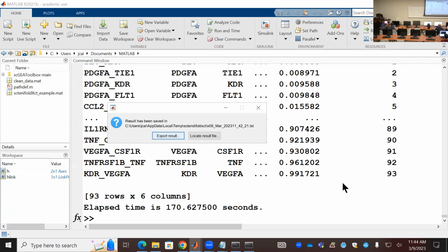Then did you copy that pipeline? Yeah, the pipe. You copy this. You have to finish this command, then you are done. You have to wait until this finishes, because this only installs Git.